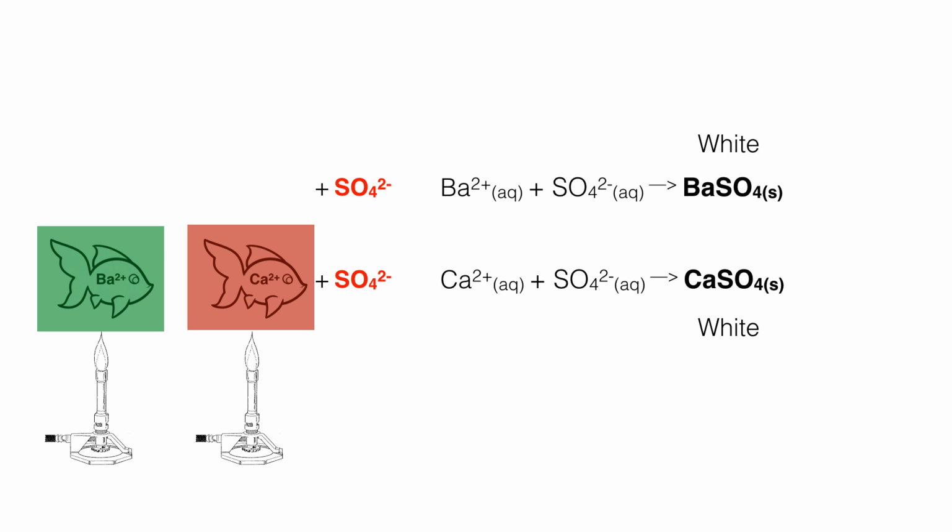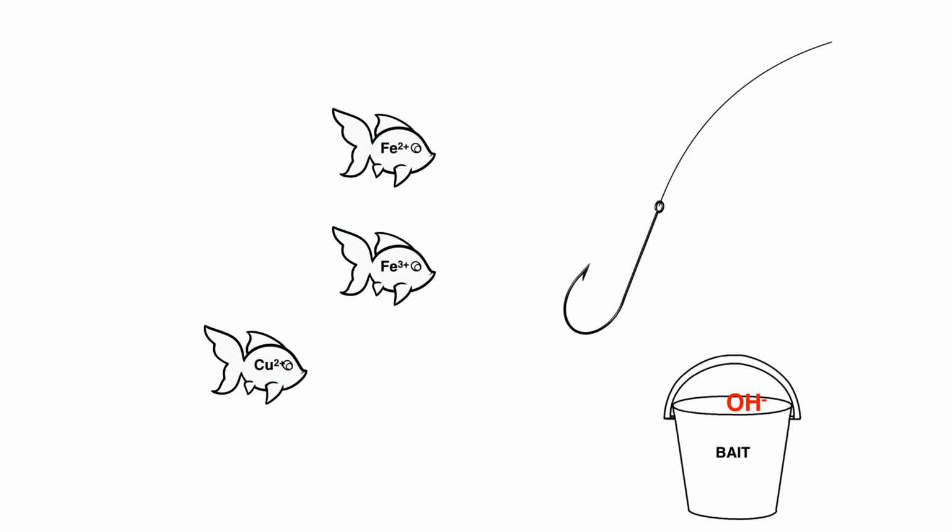However, this is our follow-up distinguishing test. We can now see that if we get a positive with sulfate in solution, we can conclude that barium or calcium, or maybe both, are present. If we aspirate that solution into the flame and we get a red colour, we can conclude that we have calcium ions. If we get a green colour, we can conclude that we have barium ions. So now, having eradicated those 3 ions from solution, sequentially by adding chloride and then sulfate, exposing them to flame tests, we're now back to our last 3 ions.